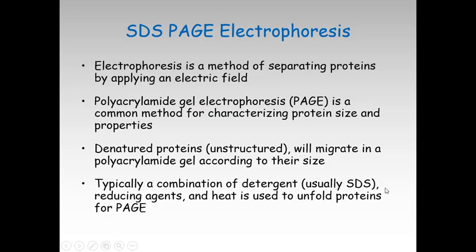SDS electrophoresis is an important technique for the separation of proteins. This method is based on the migration of charged proteins in an electric field. This technique is not generally used to purify proteins because simpler alternatives are usually available, and electrophoretic methods often adversely affect the structure and the function of proteins.